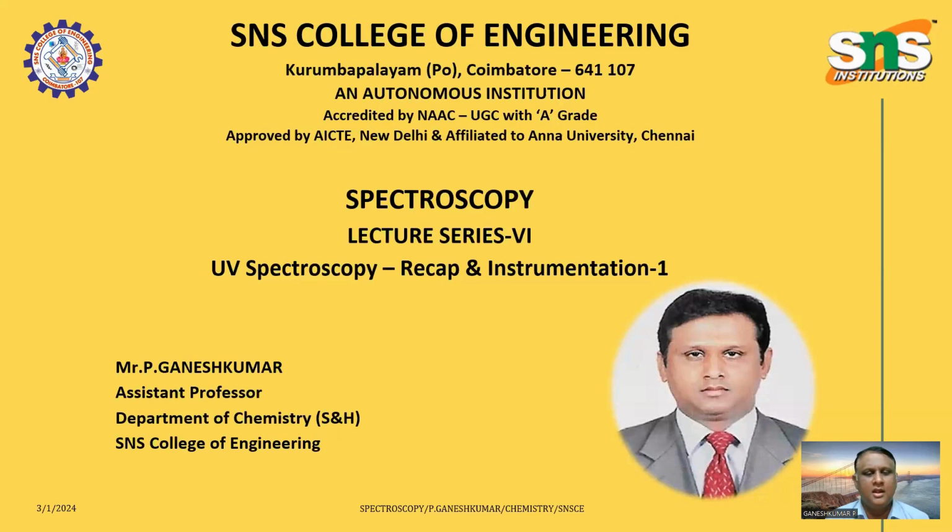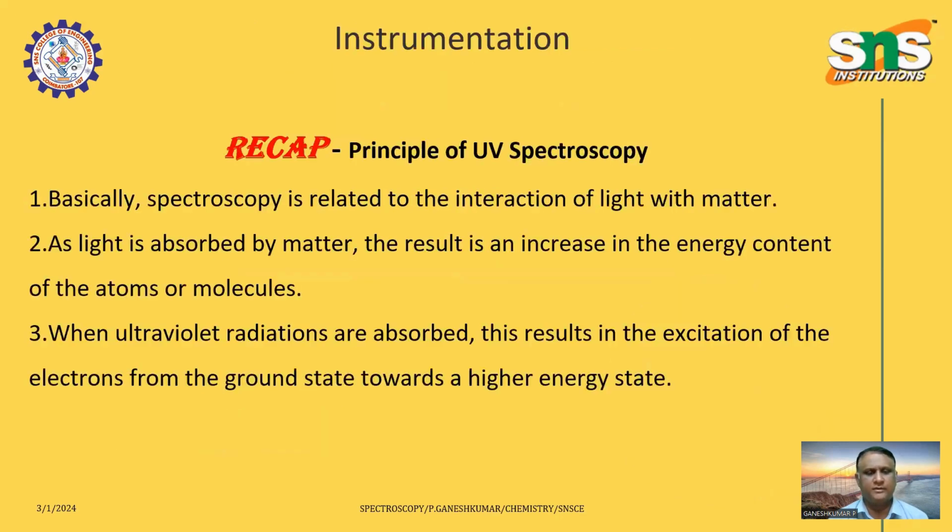Hello all, welcome to the lecture series of spectroscopy. We are in the series 6. Earlier we were discussing the electromagnetic radiation, the behavior of light, and the principle of ultraviolet spectroscopy. As a continuation of this, we can recap those things and go on to the instrumentation of ultraviolet spectroscopy.